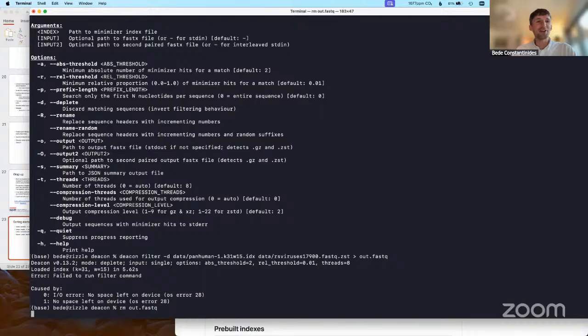See if I can recover that. But anyway, so yeah, that was running. When we started that, even though the input was compressed, I think it was running at sort of 600 megabases per second. And so on a machine with enough storage, that should take.